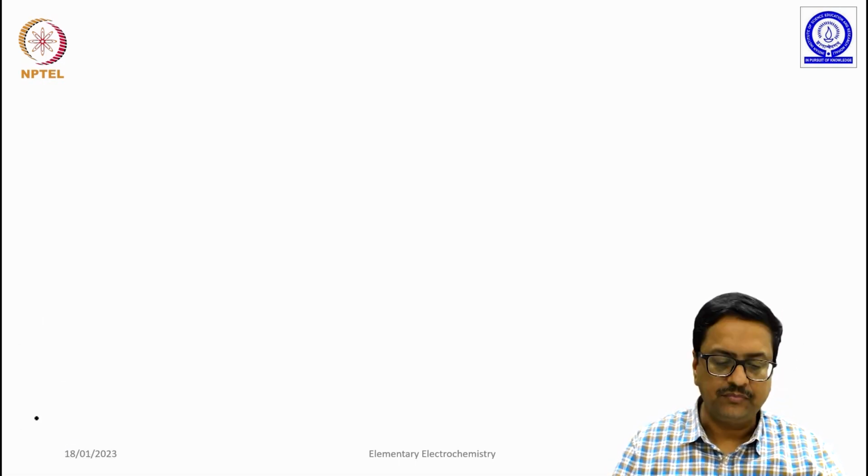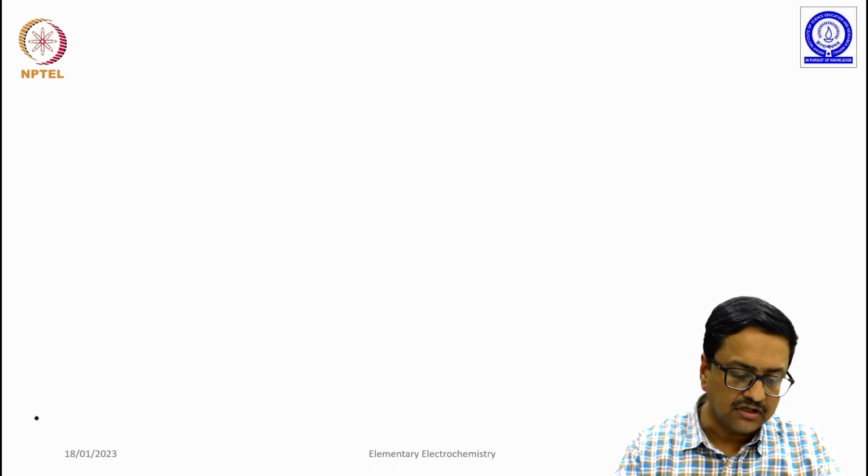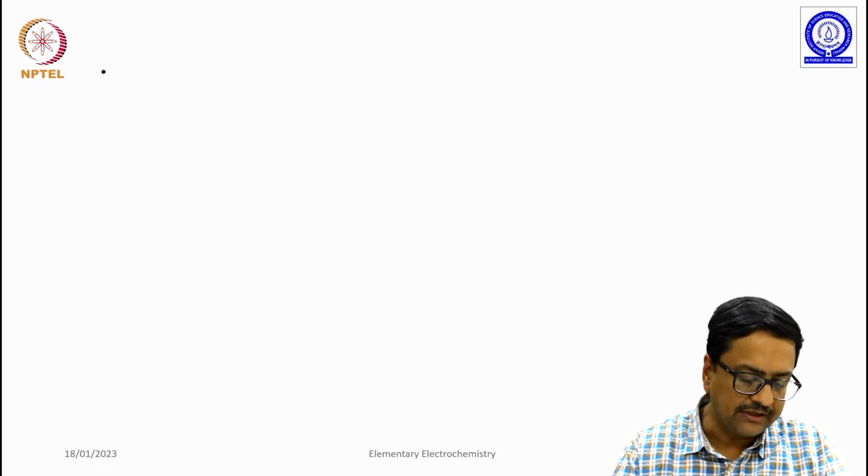If you remember, we made a standard oxalic acid solution and I assume that all of you know how to prepare the oxalic acid solution. Just for the records, I am going to show it once again here, because this is required for the calculations that I am going to do today.